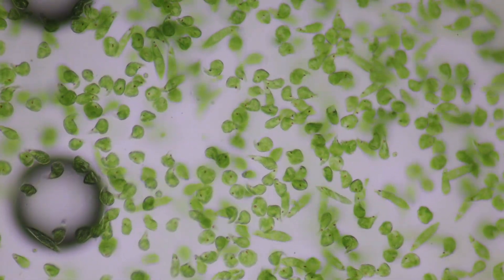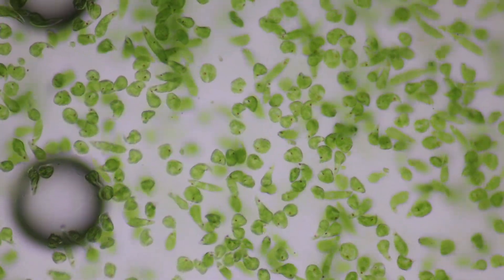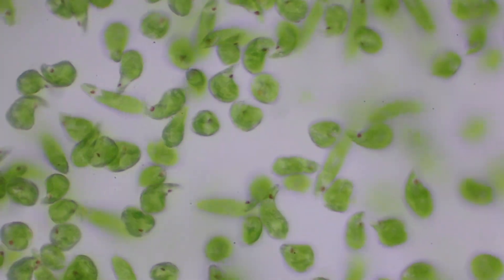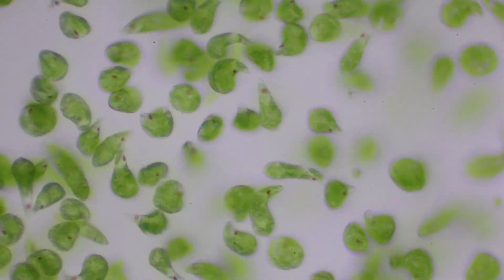Here they are closer with the ten times objective, and you can see each one of those red spots — that's the eye spot. Each euglena only has one eye spot, and that's used to sense light, and then they turn themselves so their chloroplasts face it.